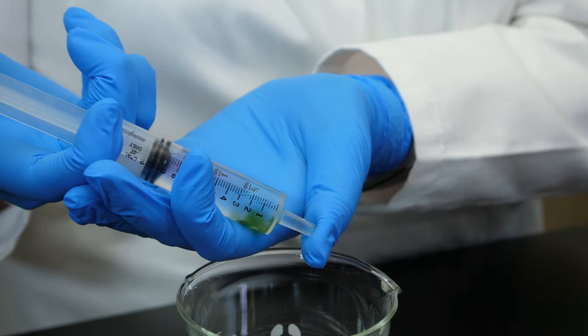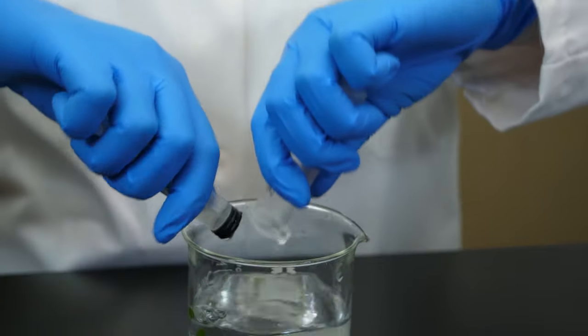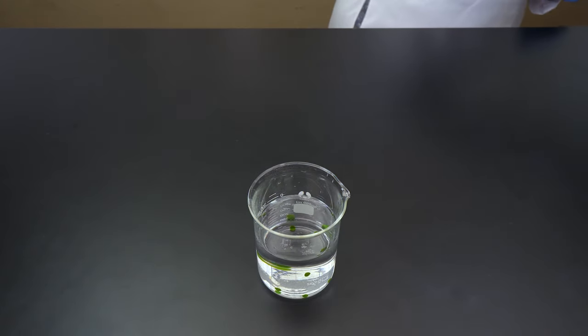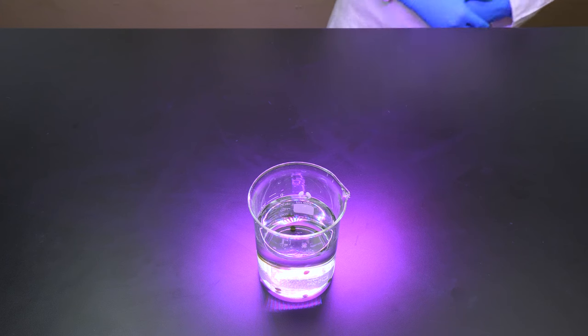This group will become our test group. We place our test group under a set of lamps. The light from the lamps should promote photosynthesis in the chads.